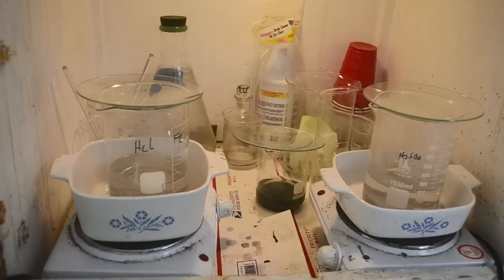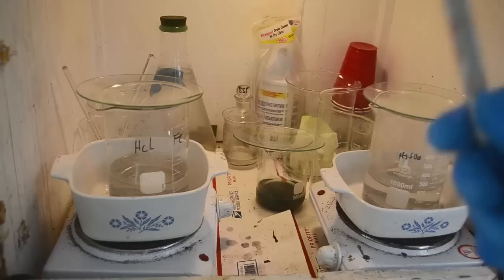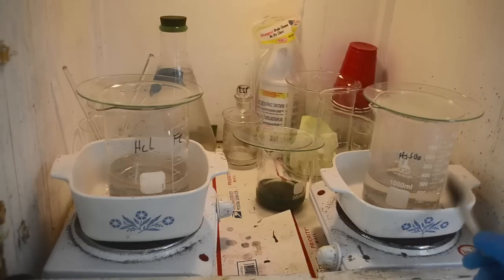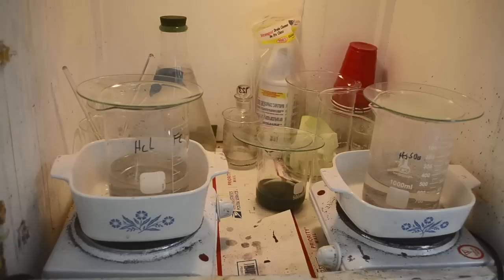H2SO4. We're going to put some hydrochloric acid in this one, some sulfuric acid in this one, give these a good long boil, and then see which is cleaner. I also want to see how much silver the sulfuric acid dissolves. I've got a feeling it's going to dissolve at least some. Not too worried about the hydrochloric acid dissolving silver. Don't think that's going to happen.